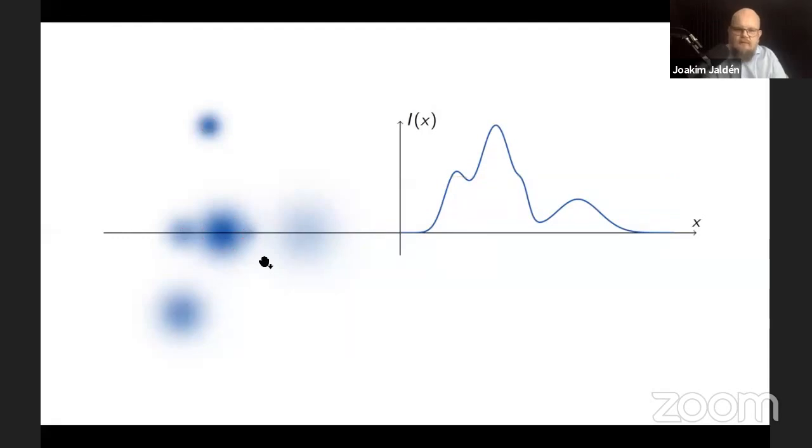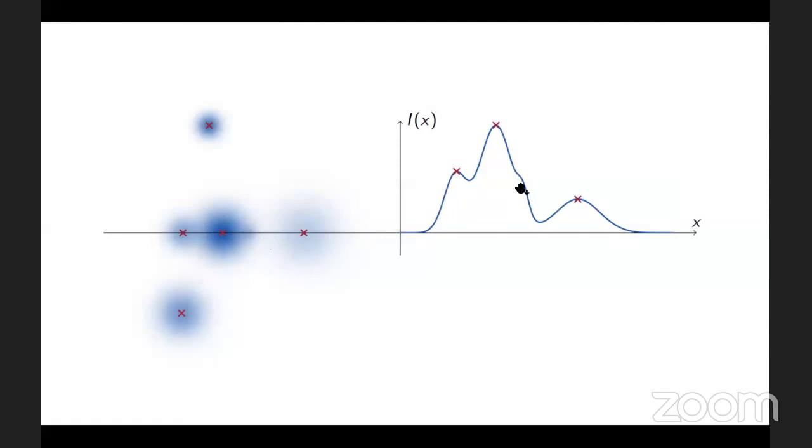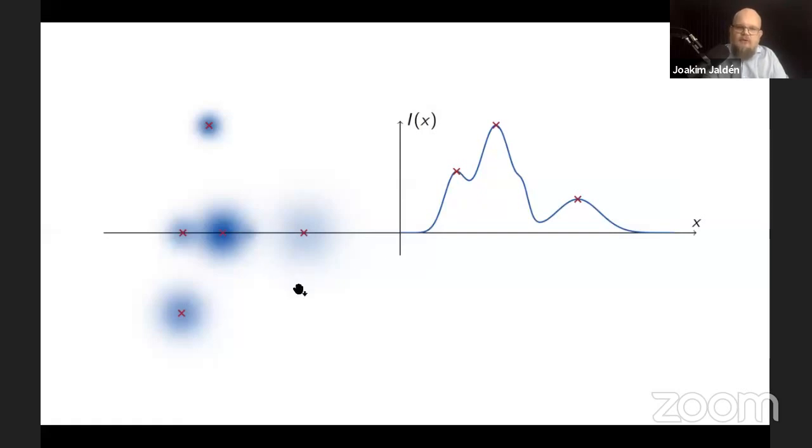Right. Another possible approach would be simply to look at the local maxima, and in this particular image, that would do actually quite well. You will get 5 out of the 6 spots, but you will still lose this spot, which has been occluded by the strong spot next to it. So you can clearly do better than this. And also about counting local maxima, of course, your data will look something more like this in reality. You will have noise on the data, which means that you have to do some form of denoising before you pick out the local maxima, and that will further reduce the resolution of spots, or the number of spots that you can possibly resolve in these experiments.